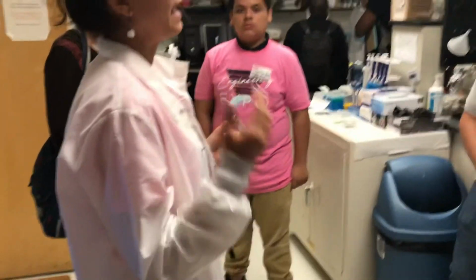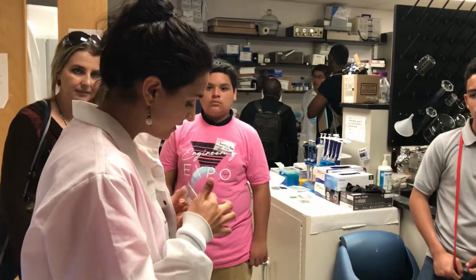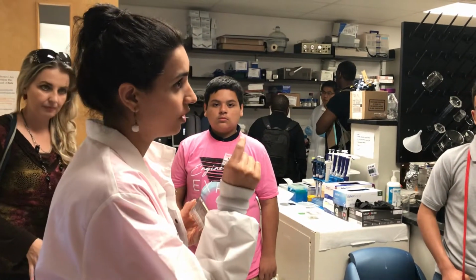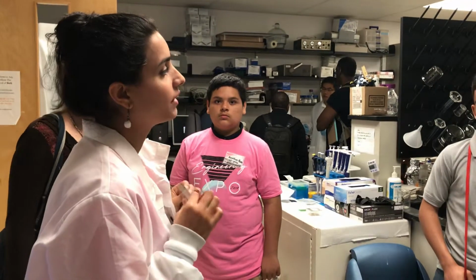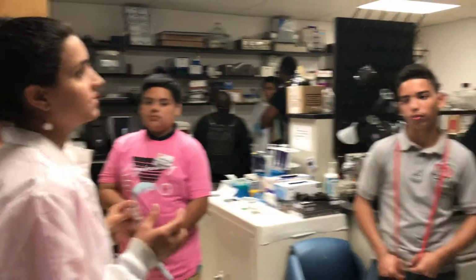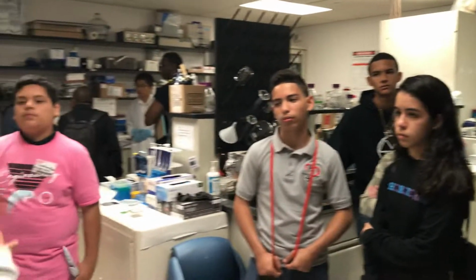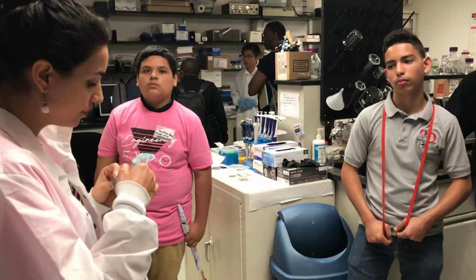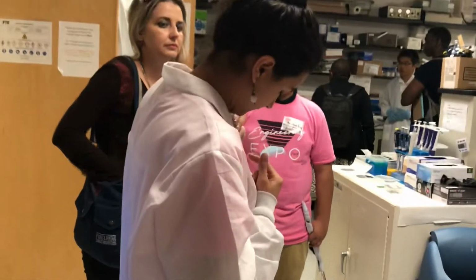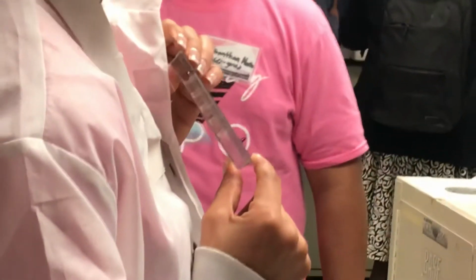So instead of testing on animal trials and testing on humans, what we have is several wells with cells in them with cardiac tissue. We call it cardiac tissue, and we call the whole thing a heart on a chip. Okay, so what we do is, for example, I want to see if this drug is gonna help slow down the rate of beating, or is it gonna pump it up. So I apply the drug in every one of these wells, and then I can connect these little gold electrodes to the computer, and I can see if it's going faster or slower.